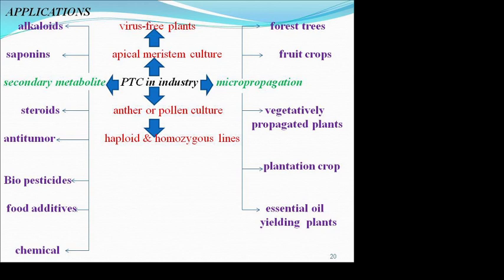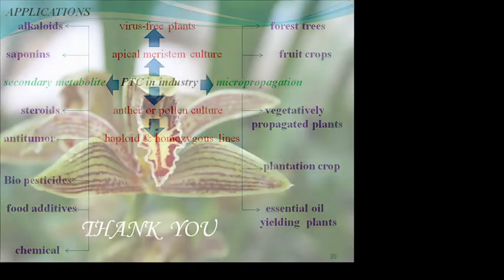Basically any plant that you want can be tissue cultured, but our target is any plant which is nearing or facing threat to extinction, or threatened or endangered plants, which are to be taken care of. This technique can be very handy and very helpful to overcome such barriers.